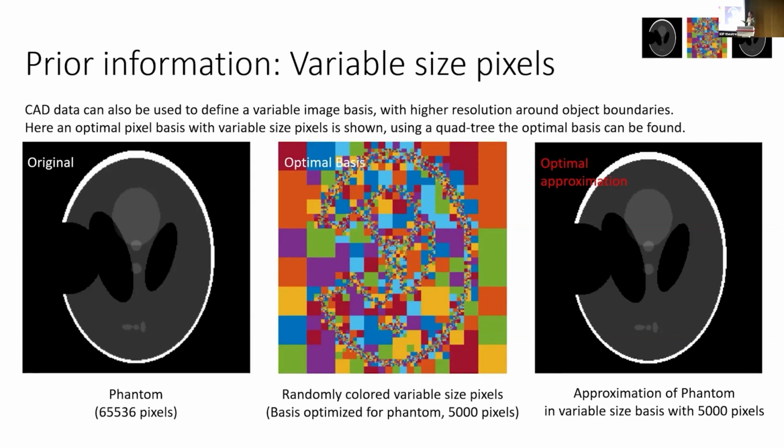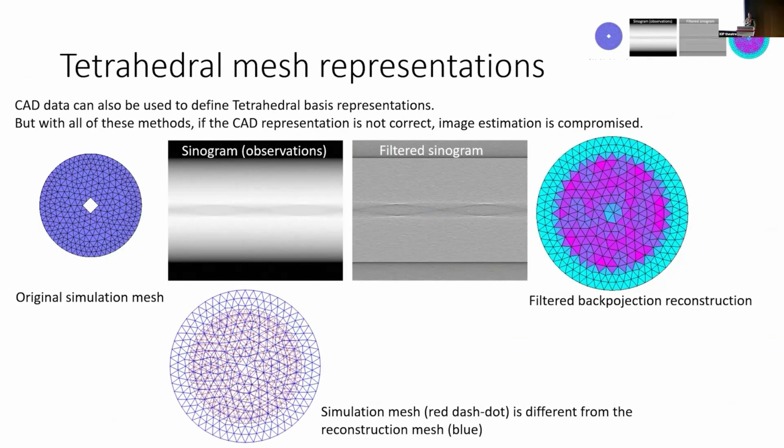All right, so these are still voxel based, variable size voxels, or groups of voxels if you want. The third one, which is what I talked about last time, is that we can directly reconstruct in more general basis functions. A typical mesh representation is, again, a simple shape. We can project, get sinograms of that, and then get a reconstruction directly into a mesh type basis. Should have really plotted in gray scale. So we have a background gray level and a foreground gray level.